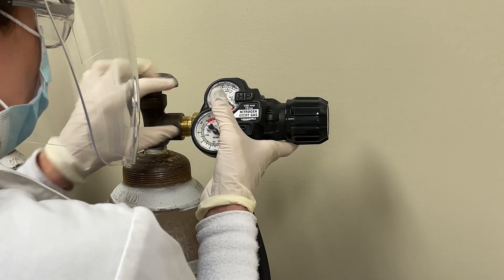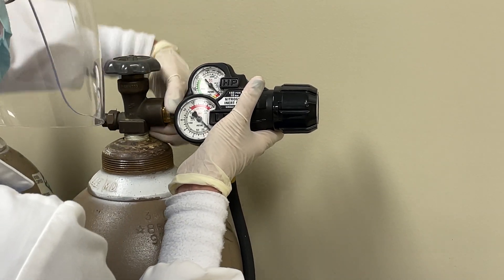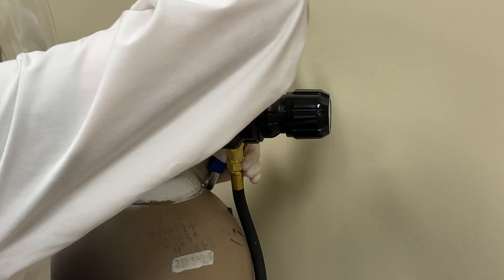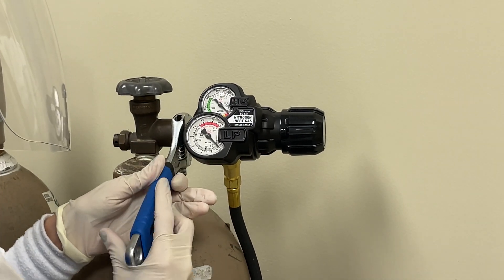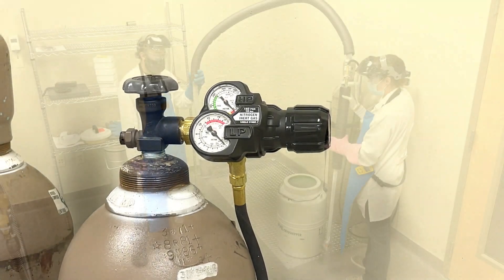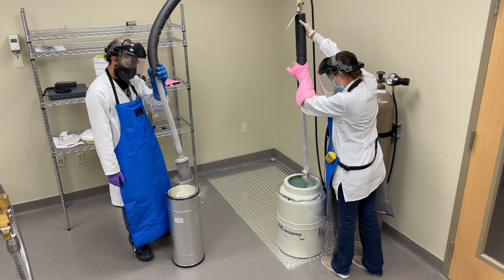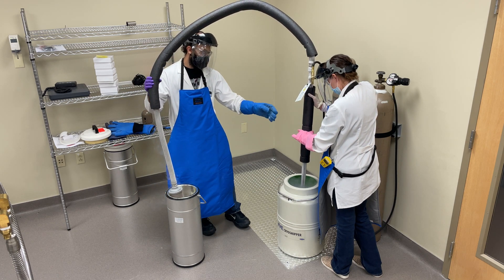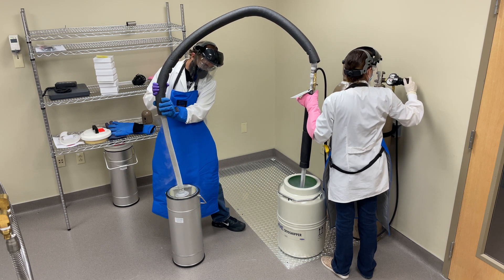Make sure to turn the pressure adjusting knob counterclockwise until there is no pressure on the adjusting spring. Use caution and place the suction end of the transfer pump into the cryoshipper, making sure it does not sit flat on the bottom of the container. Allow the metal to cool to prevent boiling and splashing of the liquid nitrogen. Place the discharge end with a phase separator into a cryogenic dewar, making sure the separator remains above the liquid nitrogen level.